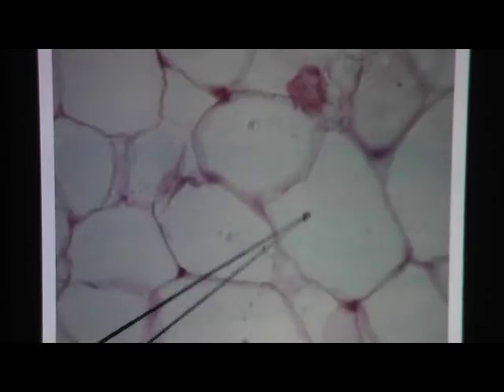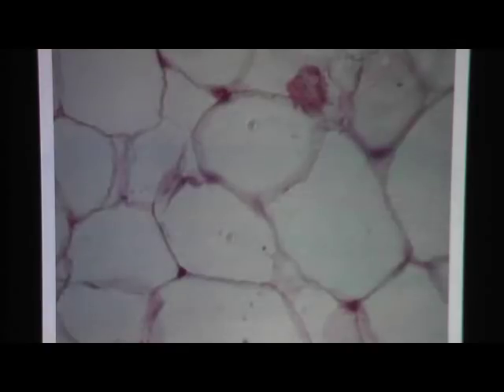Remember, you don't see a whole lot of nuclei in fat tissue. Here's a high-power view of adipocytes — one fat cell, one fat cell, one fat cell. If we ask you to name this tissue, say 'adipose connective tissue' — please include the words 'connective tissue' so it's clear what type it is. Here you might find a nucleus, and across maybe ten cells you might find only one, two, or three nuclei total.